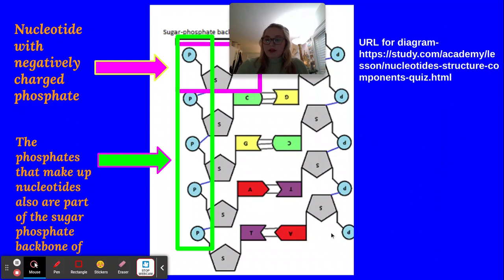Gel electrophoresis allows for the migration of the colloidal particles through an electrical charge to travel through a gel. This gel is called agarose. Agarose consists of a polysaccharide polymer, also known as carbohydrates.